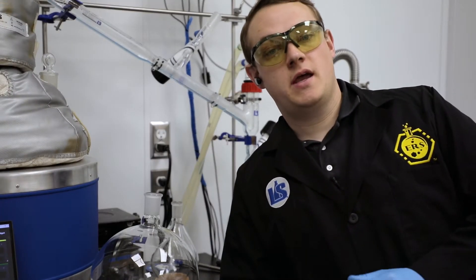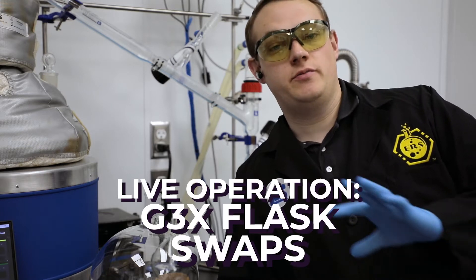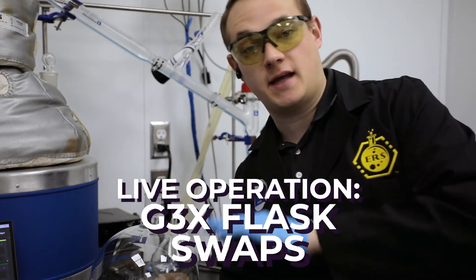Happy Wednesday! This is Mike here in the LabCity R&D Lab, and today I'm going to go over how to properly swap flasks on an active system.